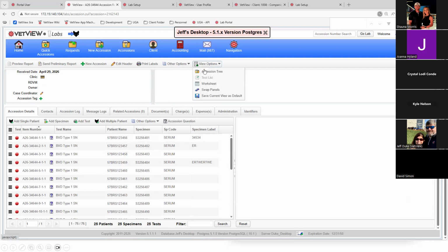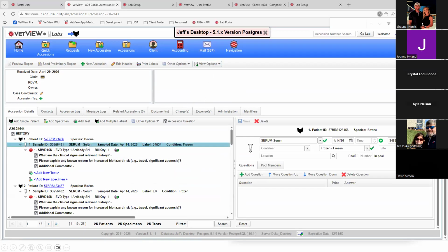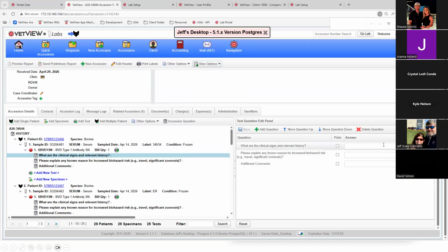Now, in the tree view and the test view, you can also flop it left and right because, as you noticed in the tree view here, kind of going back to the original one, this is your navigator and it lets you move and see as you click on things what you get in the edit panel. And in session receiving, you typically would probably want this here because you're going to be building out the case, navigating around. This is what you may be editing on the right-hand side.